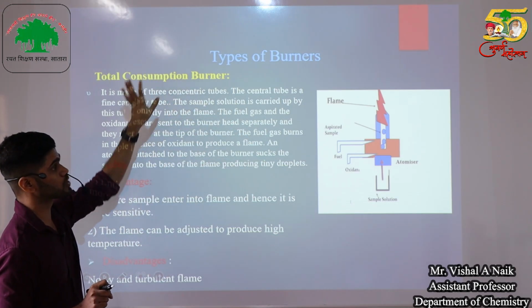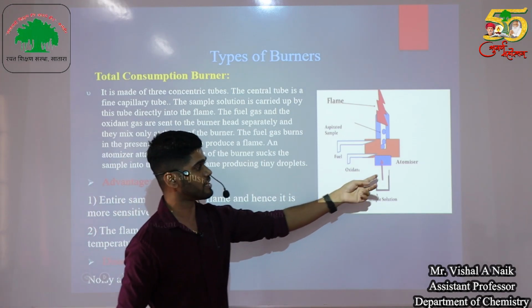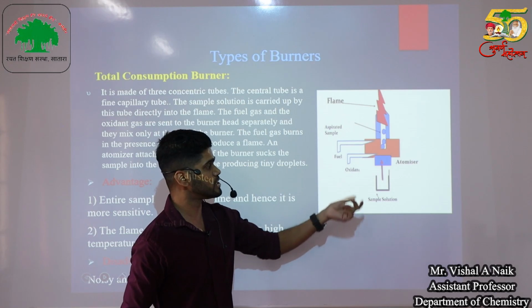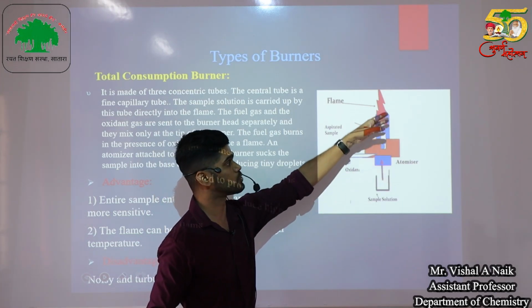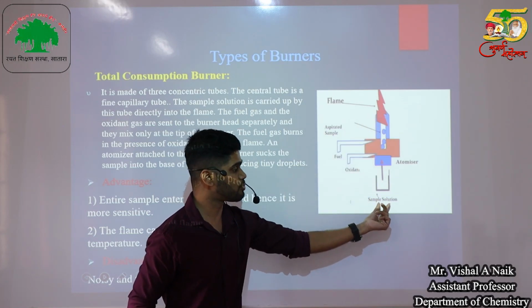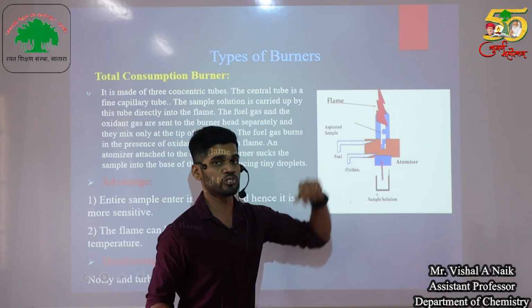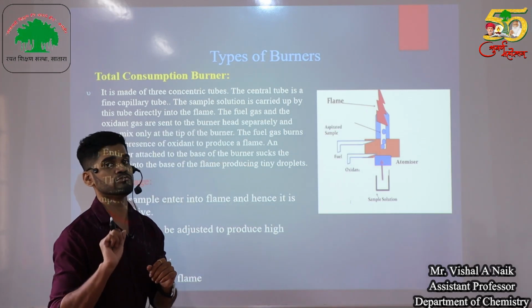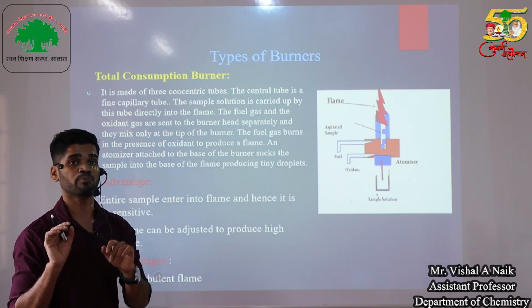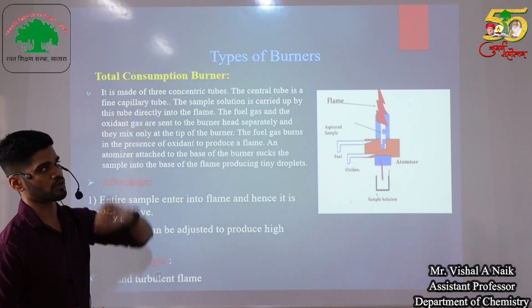That's why it is called a total consumption burner.